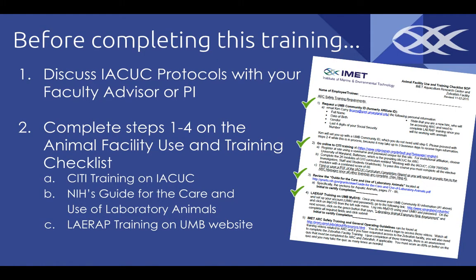Prior to completing this training, you must first complete the following. Meet with your faculty advisor to discuss and fully understand your principal investigator / faculty advisor's laboratory-used standard operating procedures and approved institutional animal care and use committee protocols, also referred to as IACUC protocols, that the PI is approved to use. As part of IACUC's oversight, they require access to the ARC be secure and all users of the animal holding facilities to be properly trained in order to receive access.